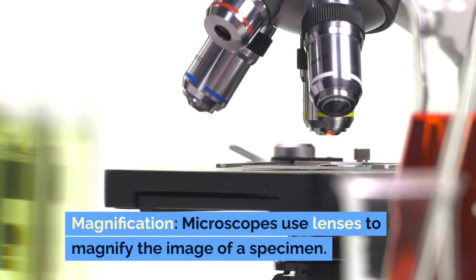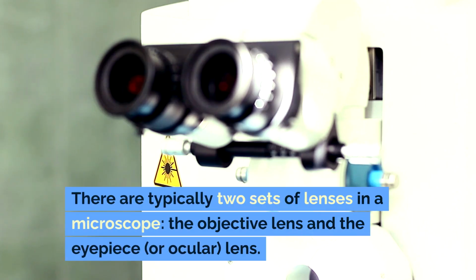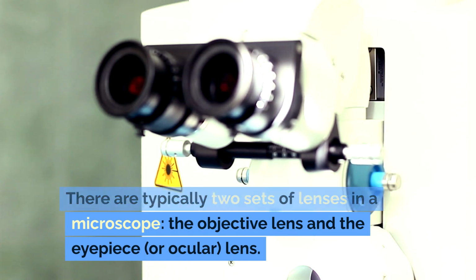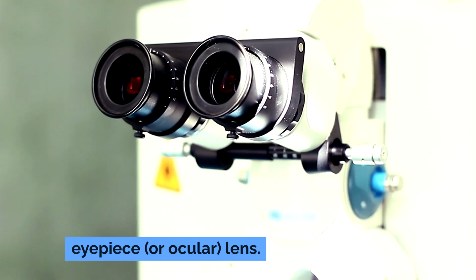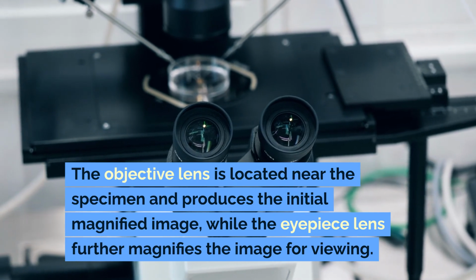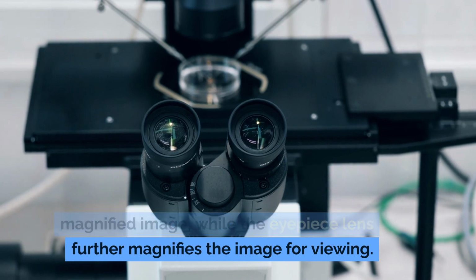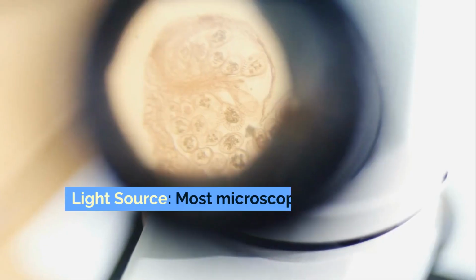Magnification. Microscopes use lenses to magnify the image of a specimen. There are typically two sets of lenses in a microscope, the objective lens and the eyepiece, or ocular lens. The objective lens is located near the specimen and produces the initial magnified image, while the eyepiece lens further magnifies the image for viewing.